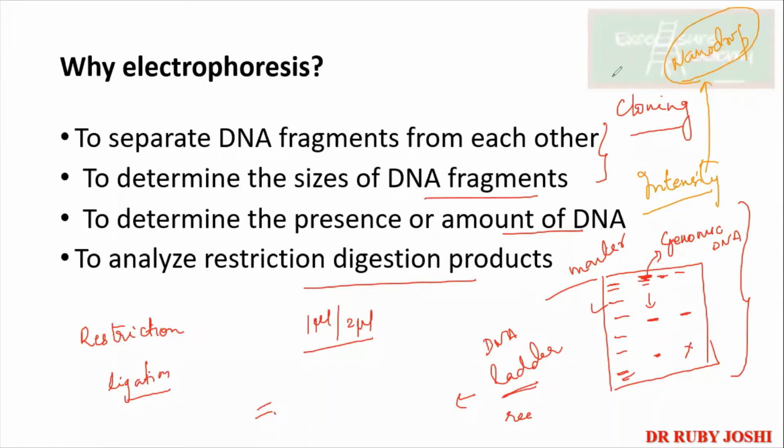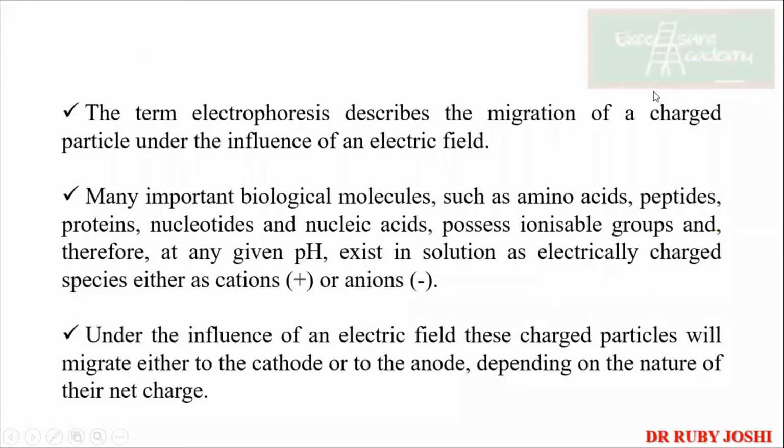Okay, so let's start with electrophoresis. The term electrophoresis describes the migration of a charged particle under the influence of an electric field. Okay, guys, are you able to follow? If you have a doubt anywhere, please stop me.